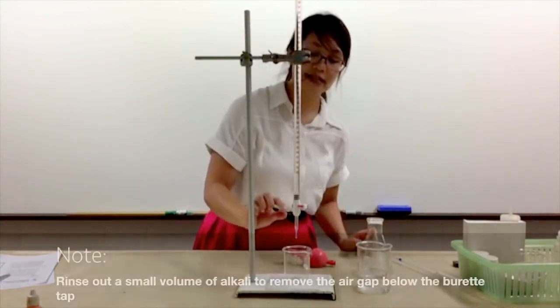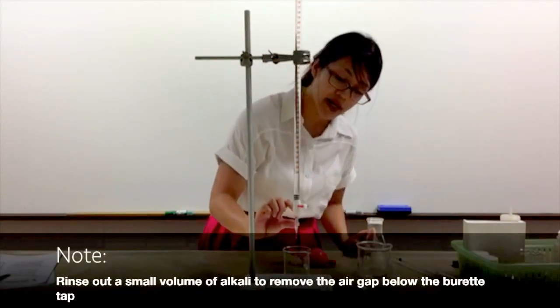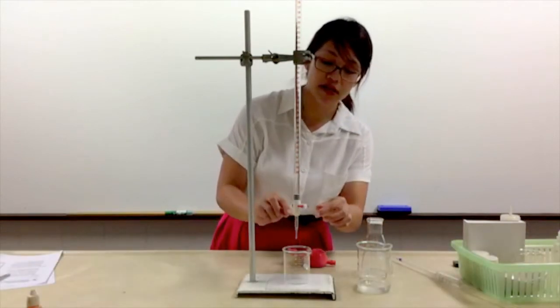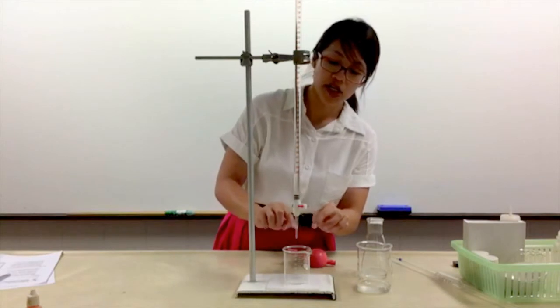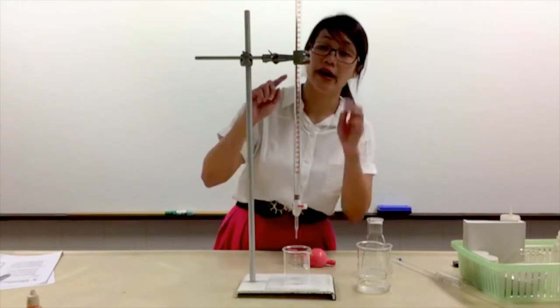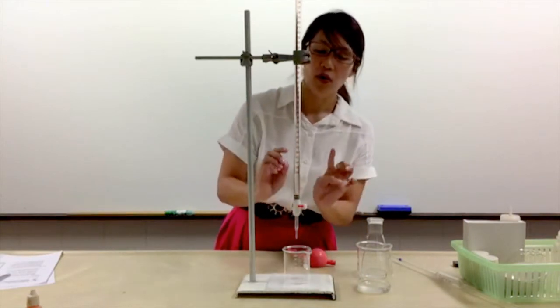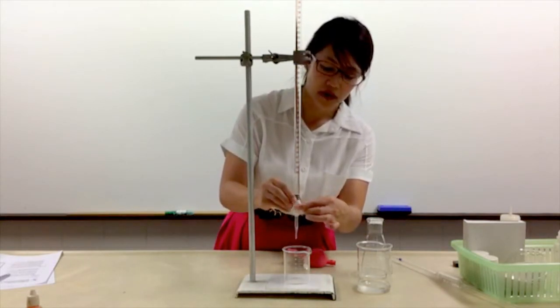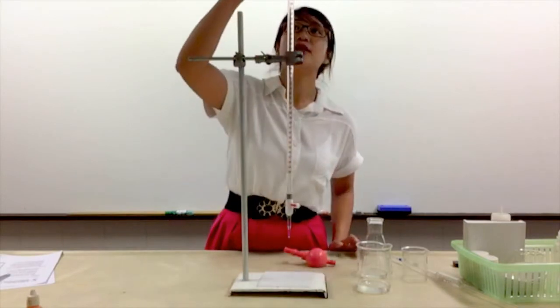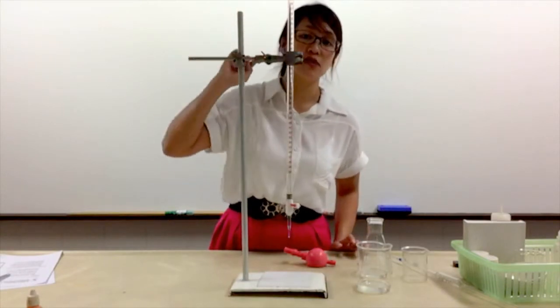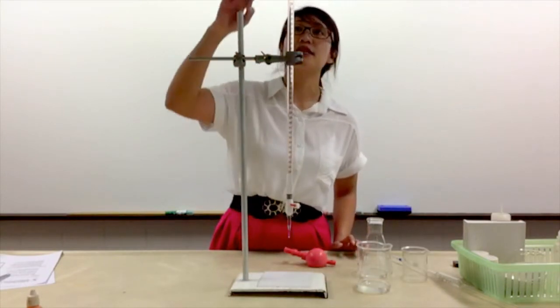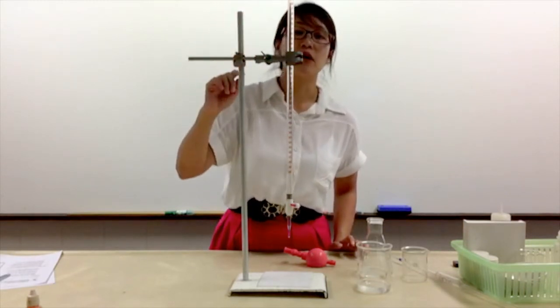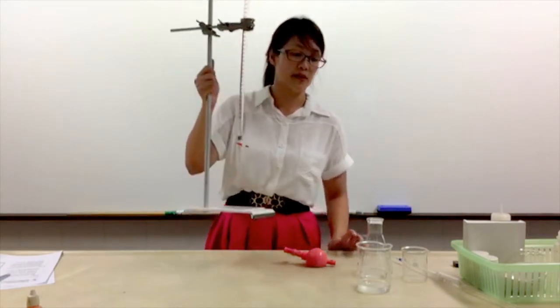Now you would realize that there is an air gap below, so you would need to rinse out the liquid such that it will be more accurate. What you can do is turn the burette tap slowly. Check that your burette level is at the zero cm³. If you realize that it is not at zero cm³, you will need to fill in more alkaline so that it goes all the way back to zero cm³.